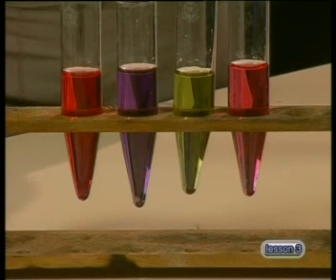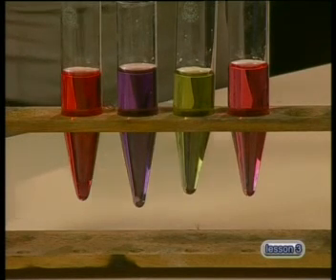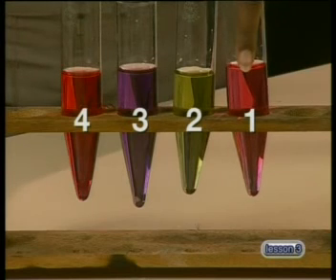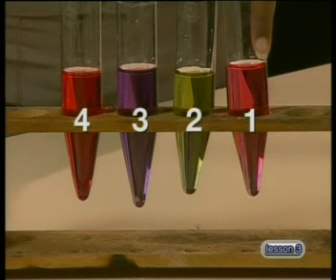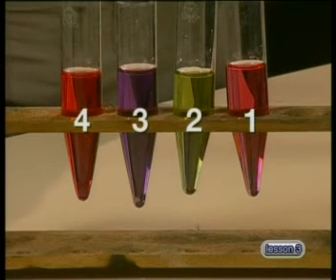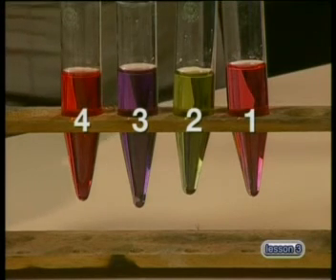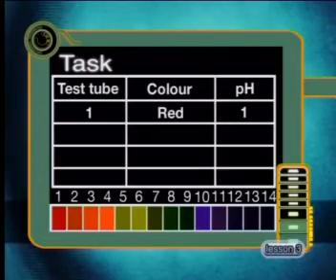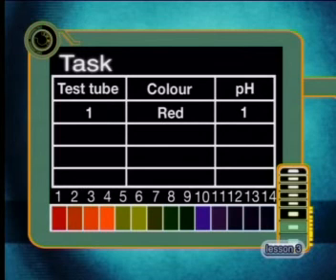Here I have added a few drops of universal indicator. In the first test tube, you can see the solution is a reddish colour. Using the reference chart, you can read off the pH as 1. For today's task, I want you to draw up a table, watch each test tube shown to you, and use the indicator reference strip on the screen to determine the pH of each solution. Remember to record your information in a table.